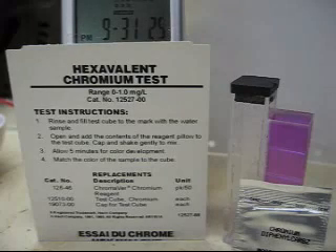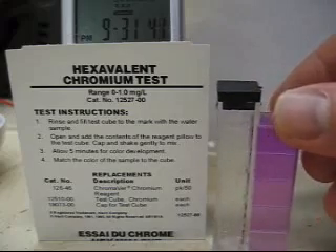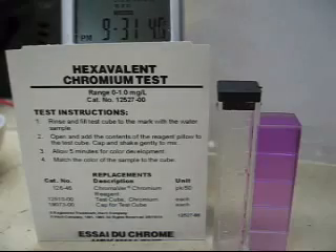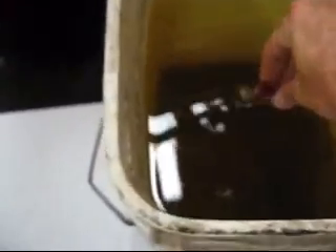You've seen in some of my past videos how I've saved the electrolyte into a bucket. So we're going to scoop up a sample out of there and run it on this little cube that comes with it. Got a color comparator right attached to it. The directions are right here in front of you. Got my little powder pillow for it and it's a five minute test. Here's my bucket of electrolyte that I've been saving. I didn't want to dump it in the yard because of the hexavalent chromium talk — I wasn't sure about it, so I didn't want to contaminate my yard.